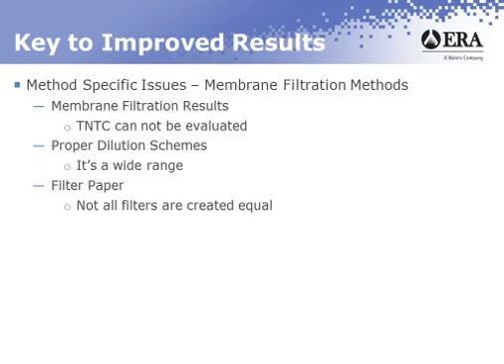Another little trick that's in Standard Methods, they talk about taking a filter and floating it on reagent water. You can take a Petri dish, put in a small amount of DI water, take a pair of tweezers, float the filter on top of the water. You should see it uniformly diffuse in about 15 seconds. If your filter floats like a little boat there for a minute, you got something wrong with your filter paper. It won't absorb the nutrients in a way that is going to get the organism to grow.